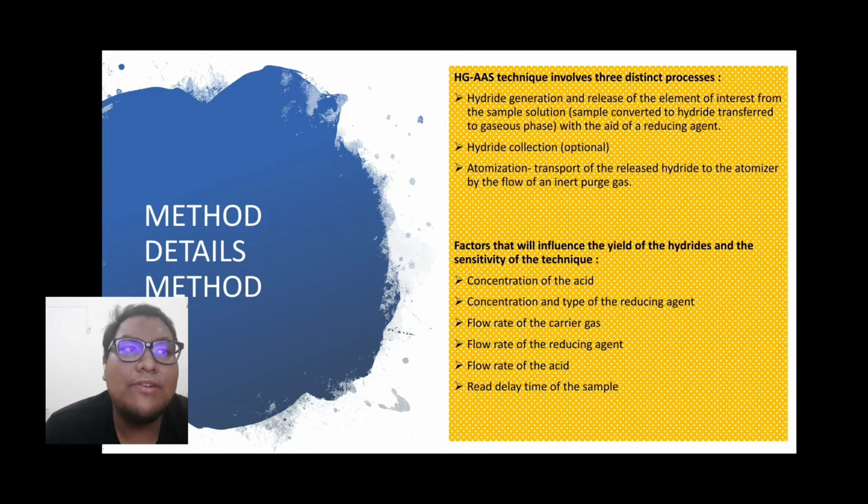It will do the separation of the analyte from the matrix by conversion to volatile hydrides and offer a pathway to trace analysis of elements such as As, Sb, and Se that cannot be determined by conventional methods. Low limits of detection or LOD are attained when this separation method is combined with atomization of the hydride, which is heated in a quartz tube.